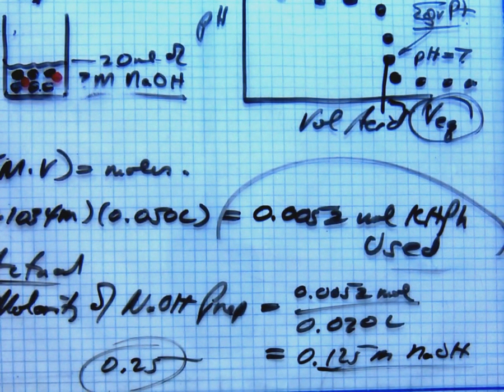Is all of this supposed to be in our lab notebook? As much as you think you need, so that you can look it up 5 years from now and teach it. And the other titration sheet, can we glue that in our notebook? Yeah. Whatever you need to help you get through the experiment is what you use. We can put whatever we need, as long as it's organized.